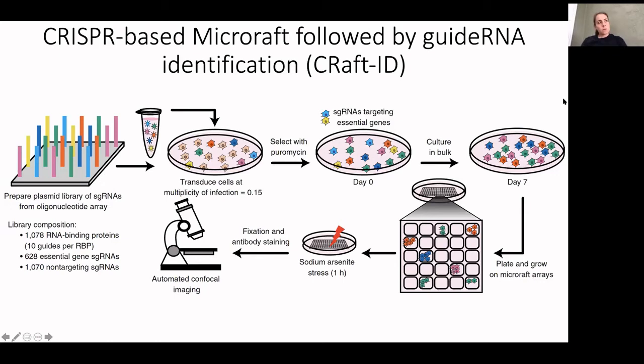Yeah, so we played with a bunch of different microscopes, and having the 1 millimeter glass slide worked out at 10x magnification. We could also have done 20x magnification had we wanted to, but we decided it wasn't useful to increase the amount of time it would take to go stepwise across the array by imaging at a higher magnification.